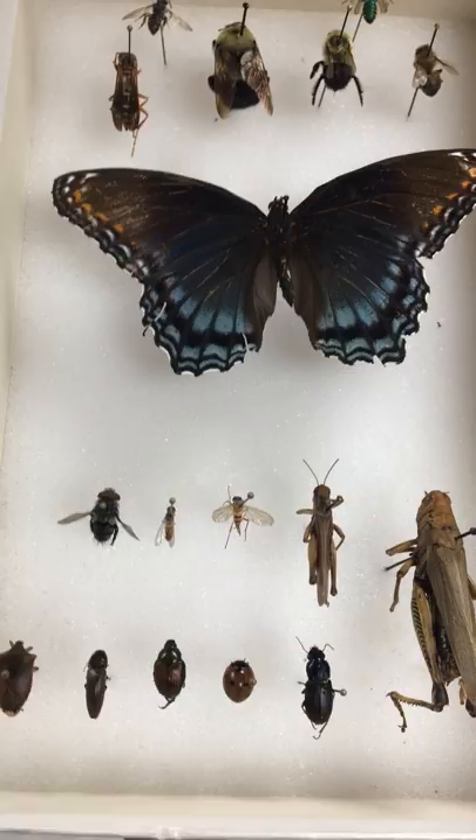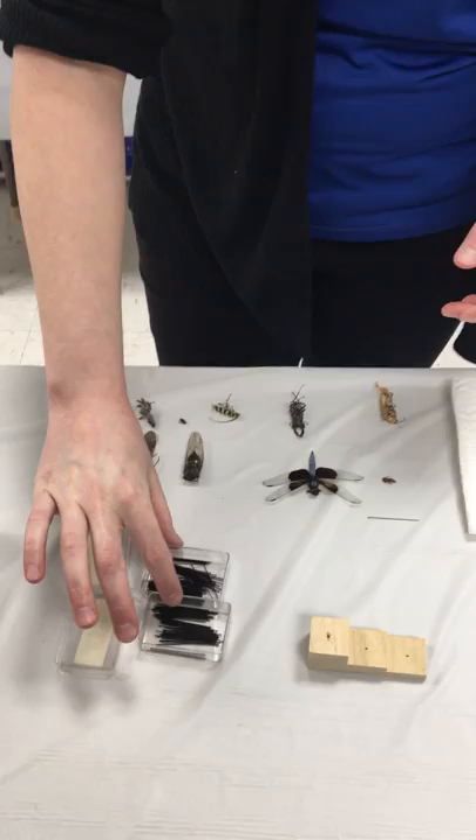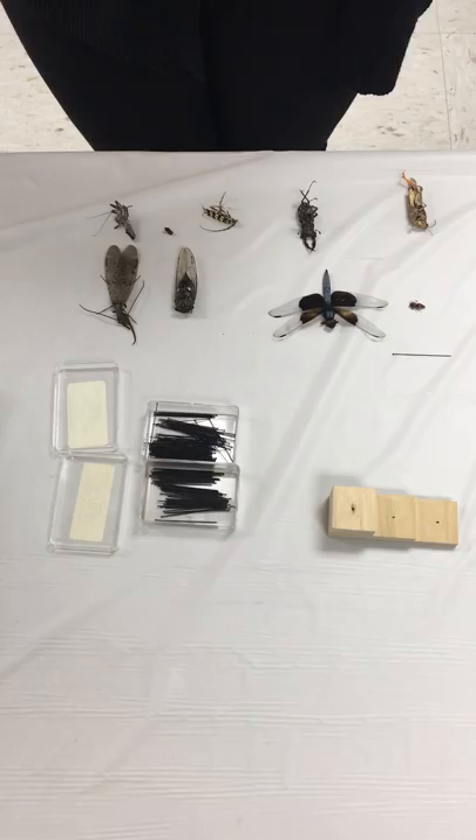You cannot use sewing needles — there are special insect pinning needles. They go from size 0-0 all the way up to 4 or larger; the larger the number, the thicker the pin. For 4-H purposes, a size 2 is fine unless you think you'll be pinning some really small or very large insects.